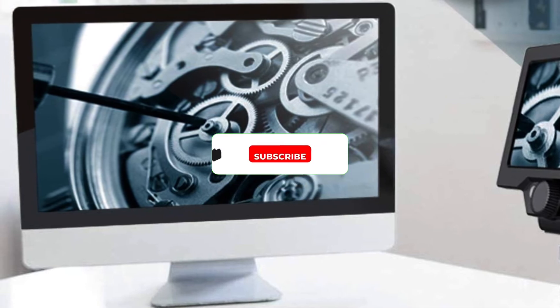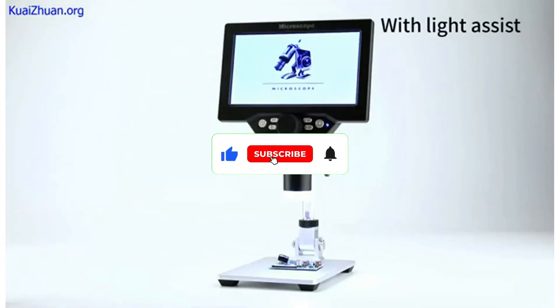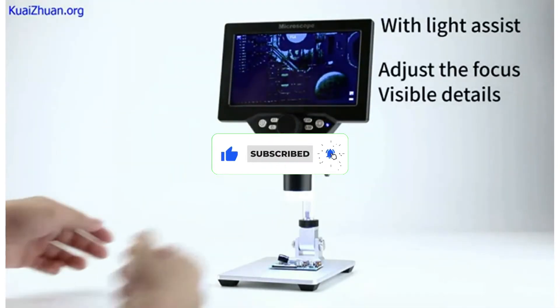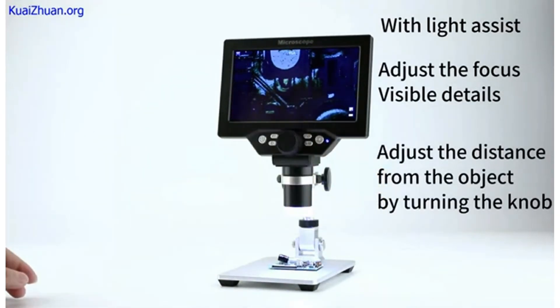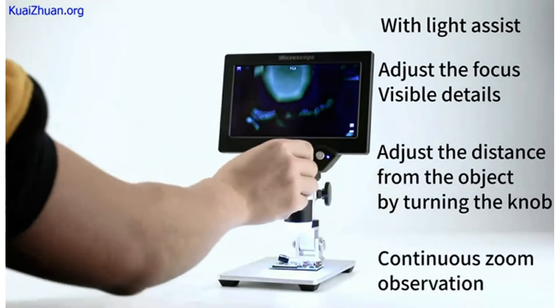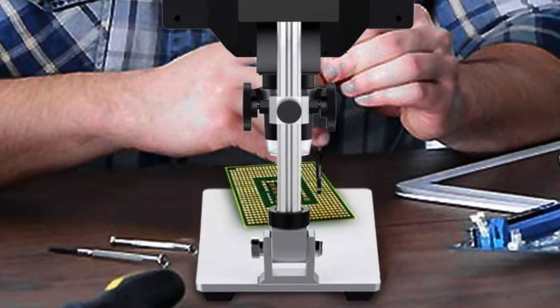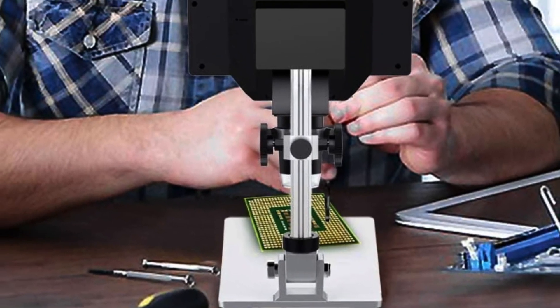For starters, you get a pretty large screen size of 7 inches with it. This can be handy for seeing the high-quality video output from its 12-megapixel camera. Another great thing about this digital microscope is that it offers up to 1200x magnification zoom, which is quite high for most users.